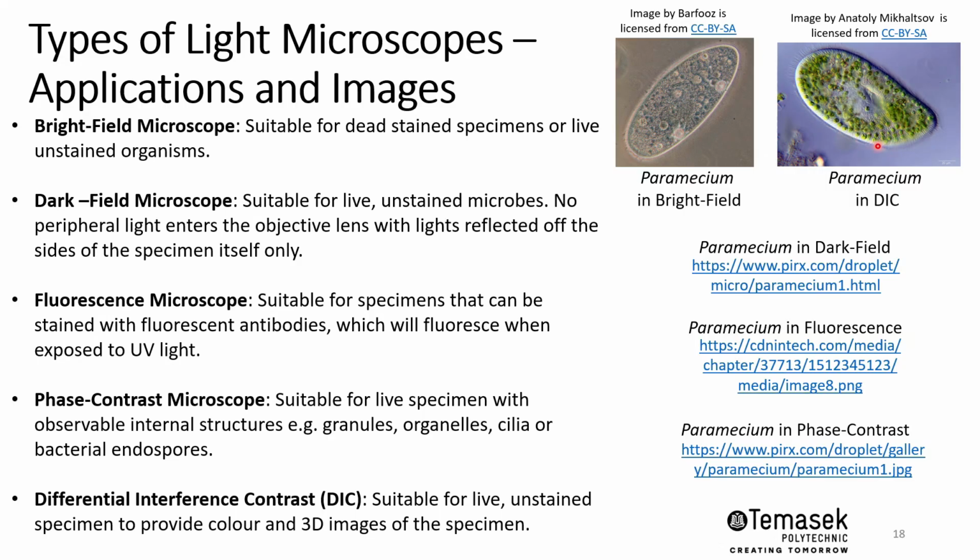All right, and overall, you can see their surrounding cilia also, but not very clear compared to your bright field microscope. All right, so it's important to know what the features of these different microscopes are, and how they are used to study the structures of microorganisms.